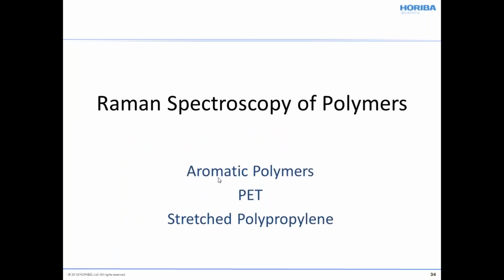So that was a little discussion then about vapor phase, liquid phase Raman spectroscopy, and the study of molecular interactions within a solvent. So you can think of perhaps other ways in which you might want to study the structure, the interactions of some analyte in a solvent for other systems.